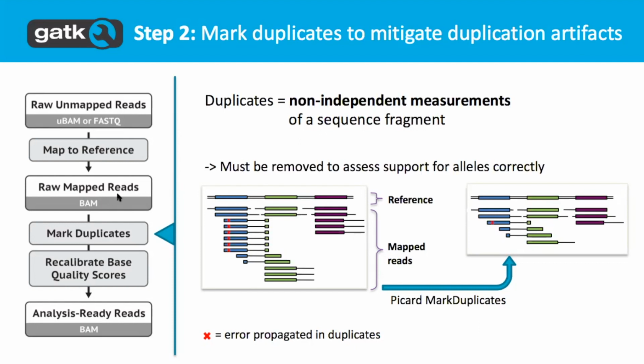The variant caller will look at that and take it to mean that there is all this evidence and confidence for that one particular variant, and this is essentially inflated. So you want to remove all of these duplicates for that reason. Also, in the case of RNA-seq, duplicates give an artificial sense of increased expression. So even for RNA-seq data, you need to remove these duplicates.